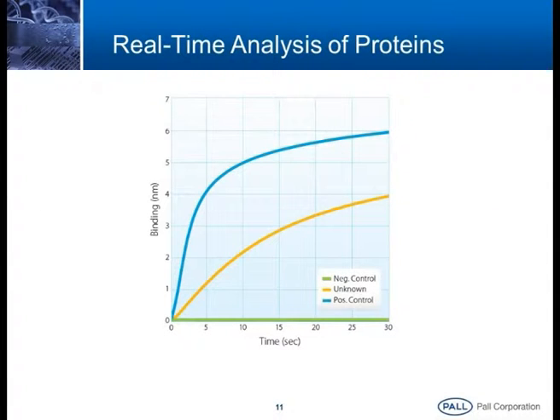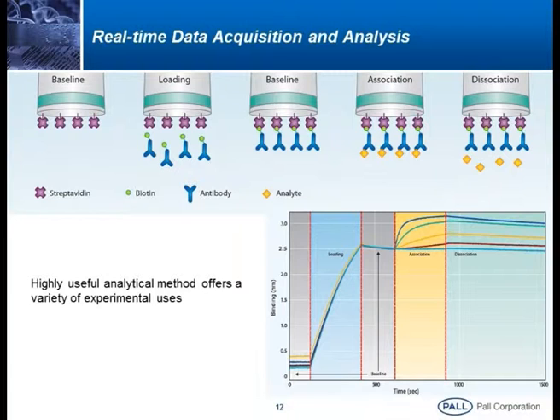So this is what the readout is and how it comes, the example I had shown. Now, how are we actually performing this kinetics?